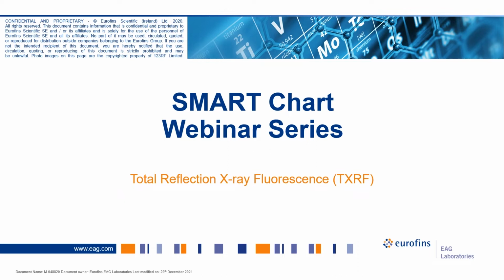I'm going to be talking about total reflection X-ray fluorescence, which I'm going to refer to throughout the presentation simply as TXRF. So I want to start off with a little bit about who's the man behind the curtain today.